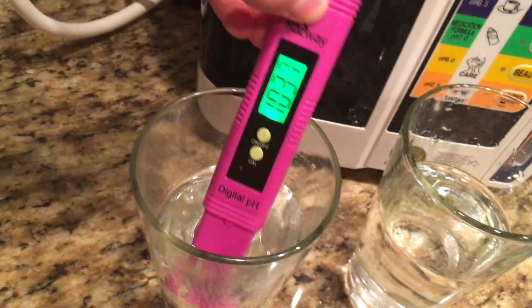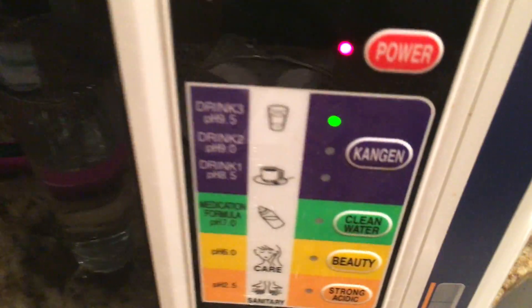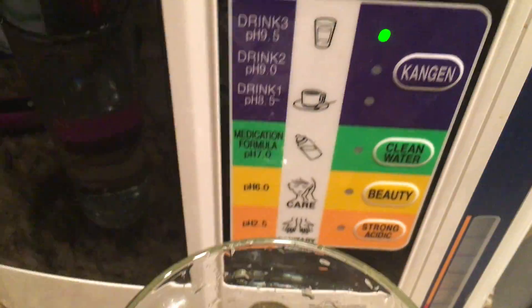So it says it's about 10.3. Now with the drops, obviously the more purple and darker it is, the higher the pH. I have it on the setting 9.5.